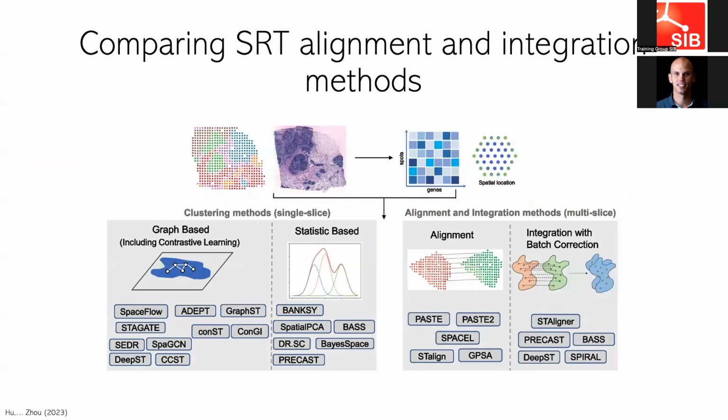Again, as always, there is a benchmark paper comparing a bunch of these methods. They also do clustering, so that will be discussed tomorrow. But they compare multiple alignment tools and their ability to do batch correction.